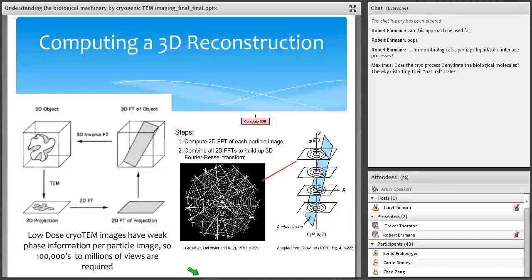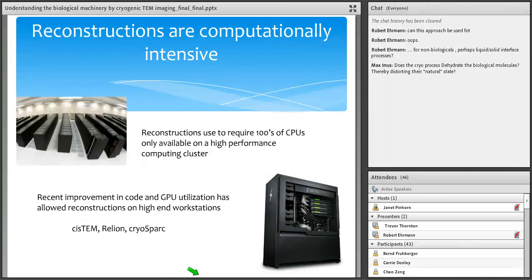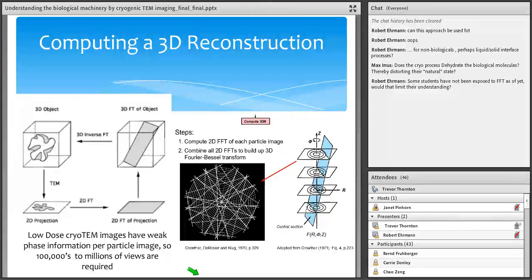And so these images go automatically onto a system that then corrects for motion that we have in our images, and that's what I'm going to talk about next. So let's just talk about the reconstruction first, though, because if we think about the computational power required to do this, we realize from these first slides that most of this work was done in the 70s, so 71, 72.